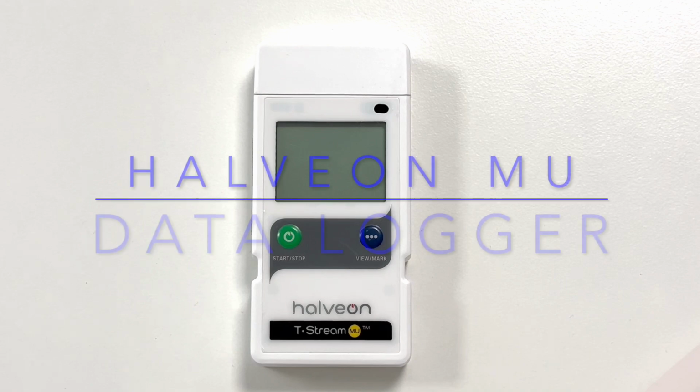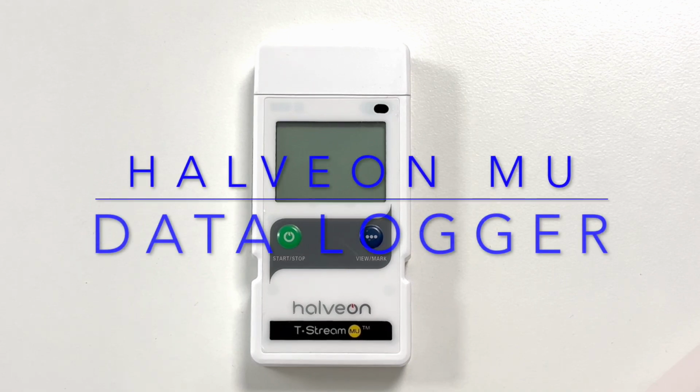Welcome to the operational instructions for the Halveon T-Stream Standard Multi-Use Temperature Data Logger. If you're interested in programming specific presets, alarms, or start delays, then please first consult our secondary tutorial video for our free software instructions before activating and recording on your multi-use data logger.